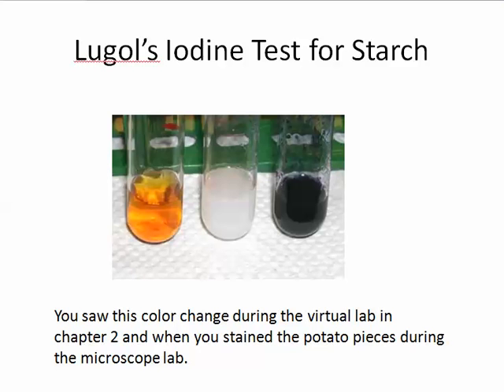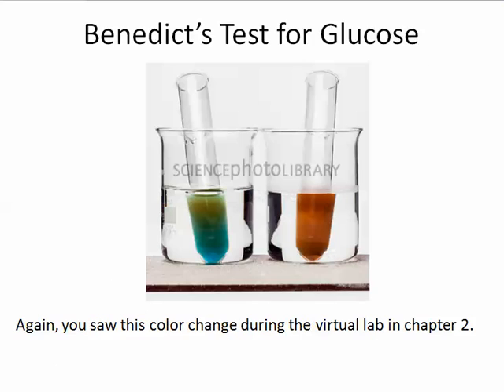So one of the things you're going to look for today is, does the iodine move into the bag? Does the starch move out of the bag? And you're going to be looking and using that blue-black color change as an indicator of the movement of those molecules. So how do we test and figure out if the sugar, if the glucose is moving across the membrane?